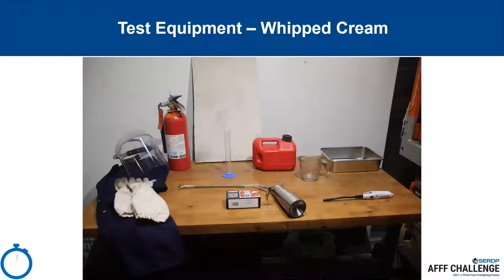This picture shows the equipment required for the compressed air or whipped cream protocol. Safety equipment for two participants includes flame-resistant gloves, flame-resistant lab coats, and flame-resistant face shields, as well as a carbon dioxide fire extinguisher. At the top of the picture, there's a 5/8-inch thick piece of drywall that can be used to smother the flame. The test setup includes a 1-square-foot seamless stainless steel cake pan. The foam will be prepared with a whipped cream dispenser, a 3/8-inch internal diameter flexible rubber tube that's four inches long, a half-inch stainless steel tube that's one foot long, aluminum tape, and a Burns-o-Matic fan pattern propane tank tip. Compressed air is provided by 8-gram stainless steel nitrous oxide chargers. Foam solution measurement will be done in a 100-milliliter graduated cylinder. Ethanol-free gasoline will be measured in a 500-milliliter measuring cup. The gasoline will be ignited with a simple barbecue lighter, and all waste material will be collected in a Department of Transportation approved fuel container.